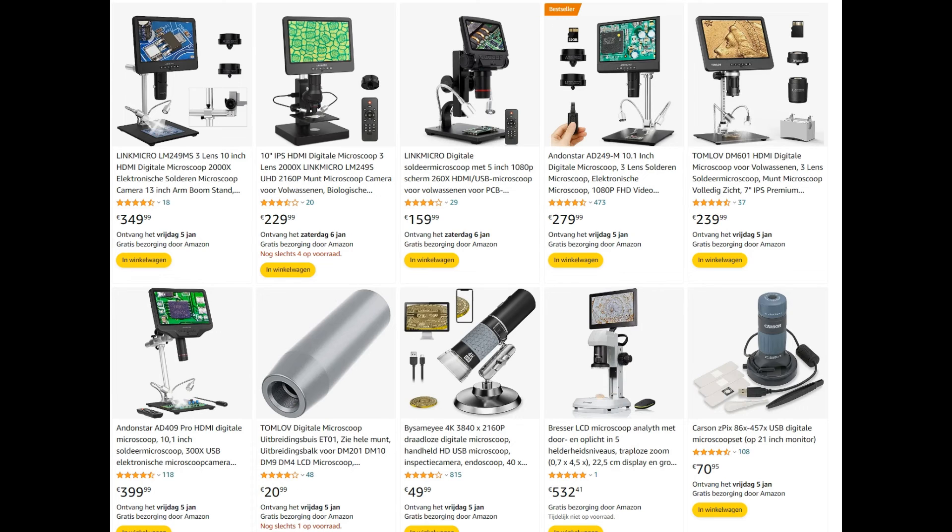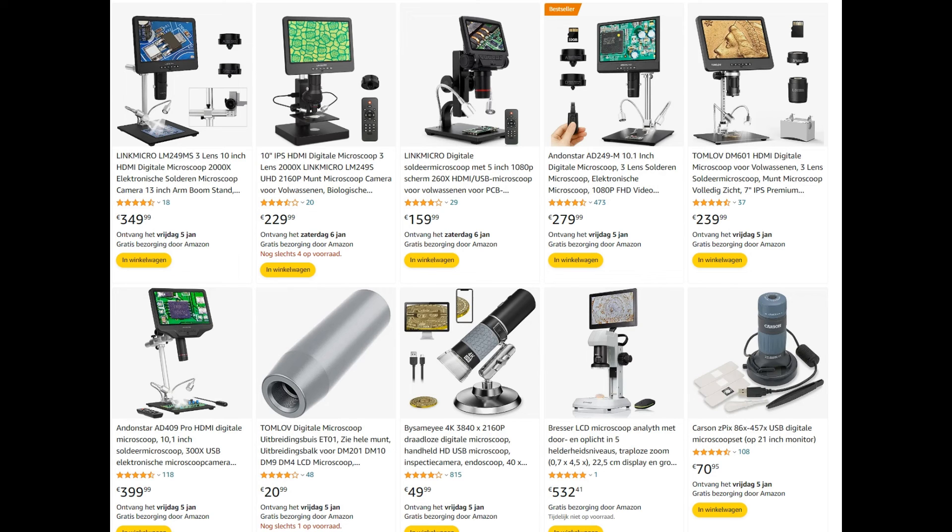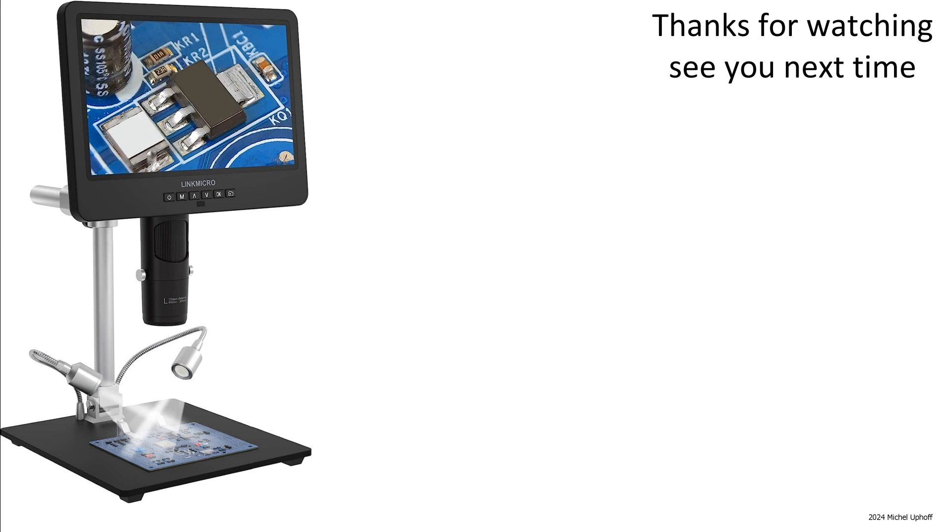It is nice that a larger screen is built in, but the advantages of this should not be overestimated. The build quality could be better and is generally lower than that of the LinkMicro LM407 Pro. The software is substandard, but the image quality is really excellent. For those interested, I will put the relevant links to the product in the comments, and please consider a subscription.